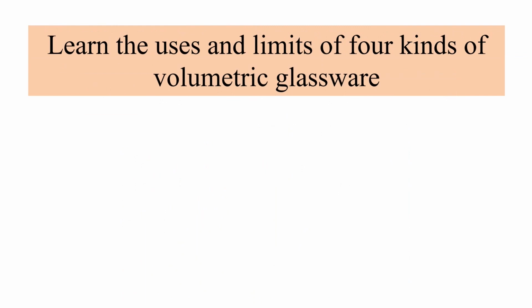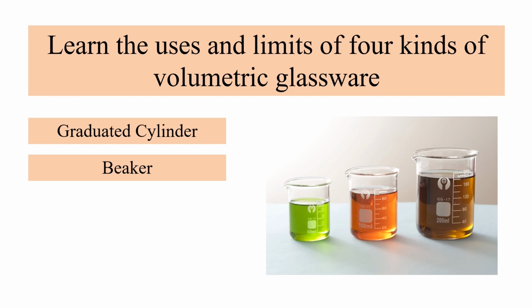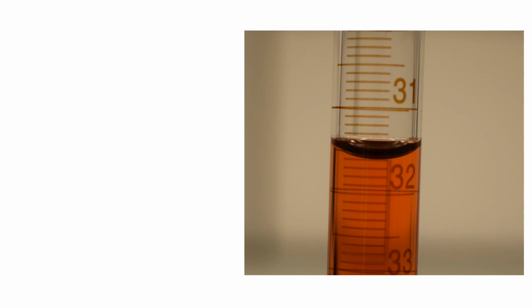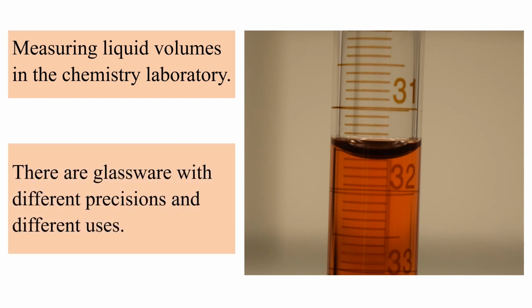In this lab, we'll learn the uses and limits of four kinds of volumetric glassware: the graduated cylinder, the beaker, the pipet, and the buret. These pieces of glassware are important for measuring liquid volumes in the chemistry laboratory. As we'll see, there are glassware with different precisions and different uses.